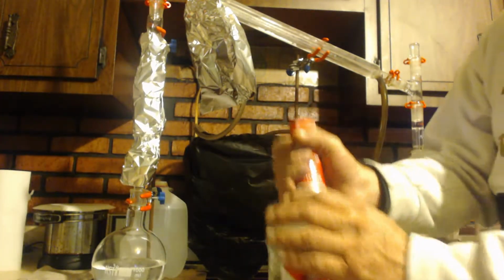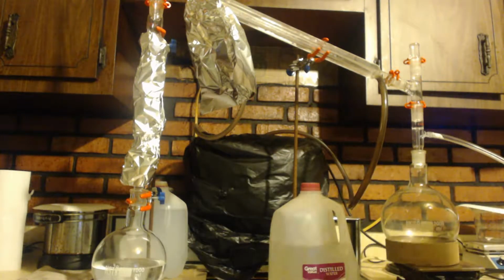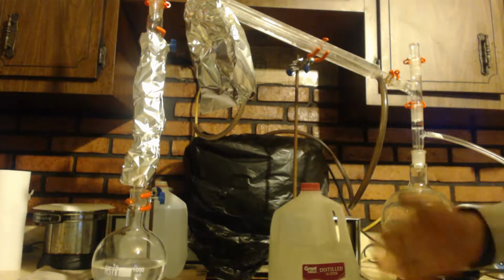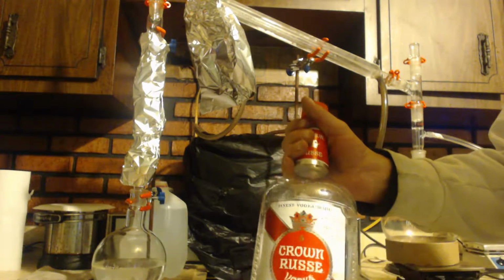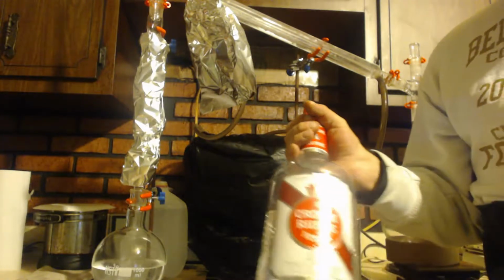So I'm close to being at the azeotrope. I took out 500 milliliters and I put it in there, and now I'm going to distill it a second time. The reason why I'm not doing it all, or you know, 1,000 milliliters, is because I'm going to save this and do it in my How to Get video, where I show and tell several different ways to get it.